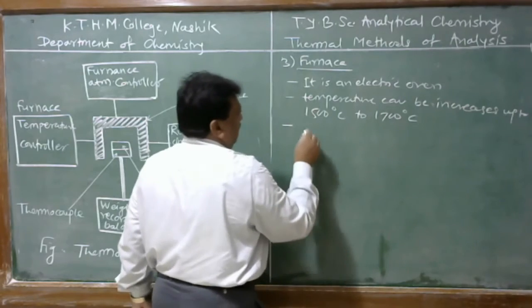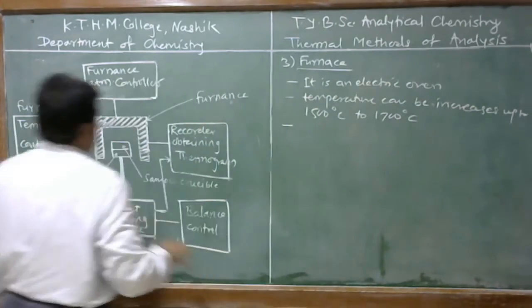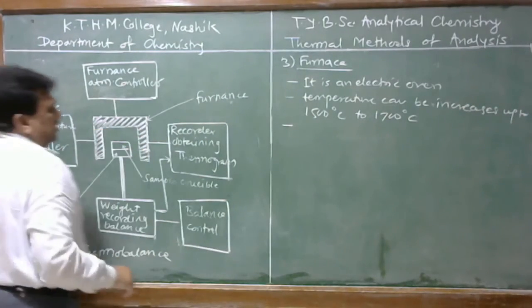Furnace is actually the center of this thermobalance.